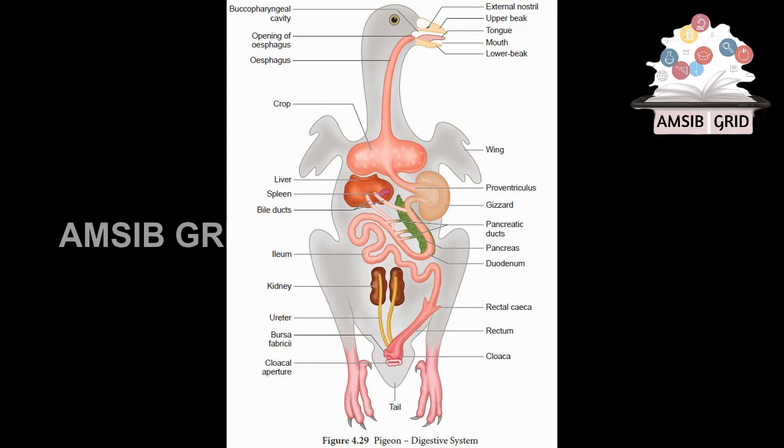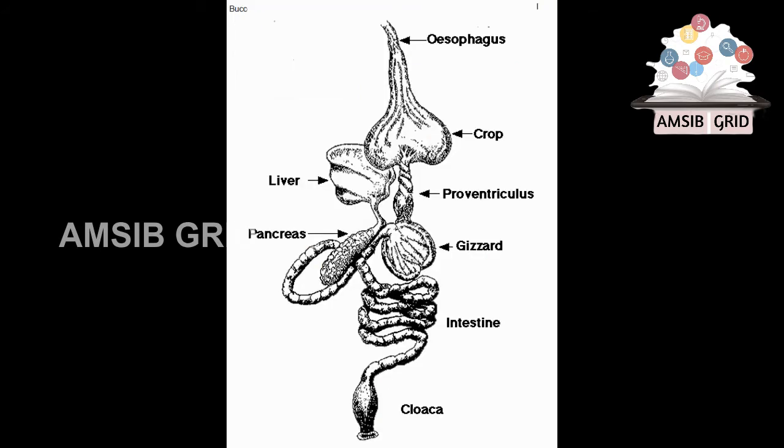A bird has two stomachs to digest its food in record time. The upper stomach, the proventriculus, comes right after the crop. In this part of the stomach, digestive enzymes secreted by glands break down food that has passed into the stomach. The lower stomach, the ventriculus or gizzard, is a tough, muscular organ which crushes and grinds up the food, just like our teeth do for us.